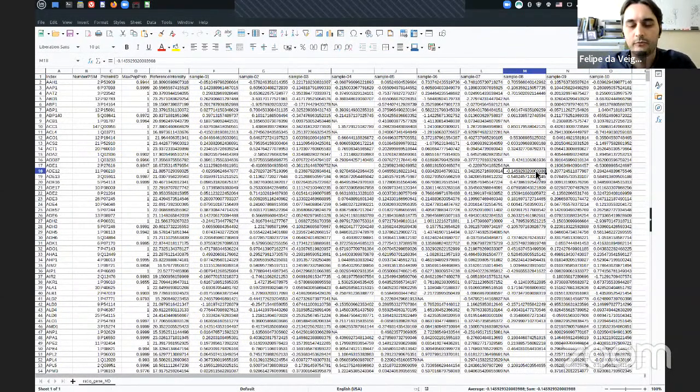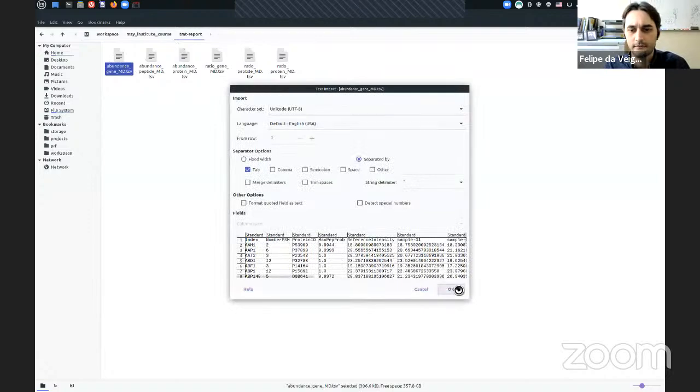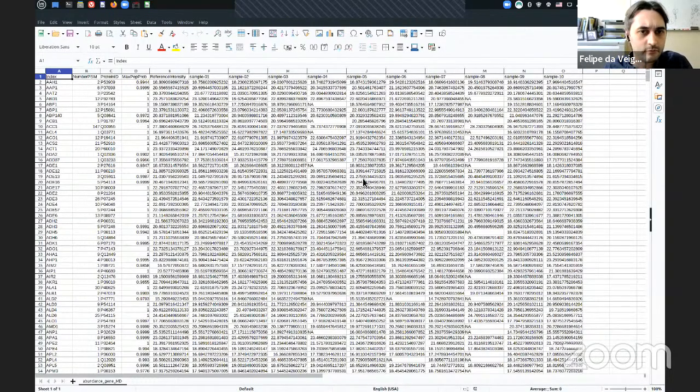They're negative because of the way we normalize. I don't recall exactly how the calculations work right now to make them look like that. But, well, I think they're negative because I opened the ratios, right? Yeah, there you go. They're negative because of the ratios, and that's because of the adjustment to the reference channel. These channel values are normalized using an internal reference. So yes, we were looking at the ratio, and that's why some of those are negative.